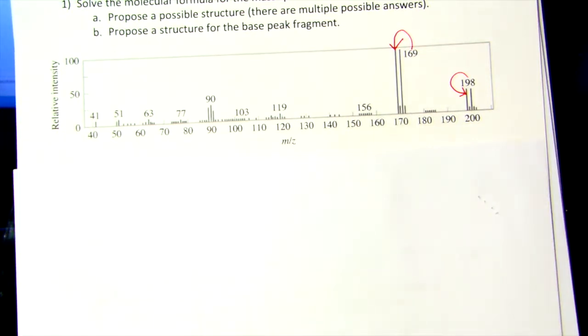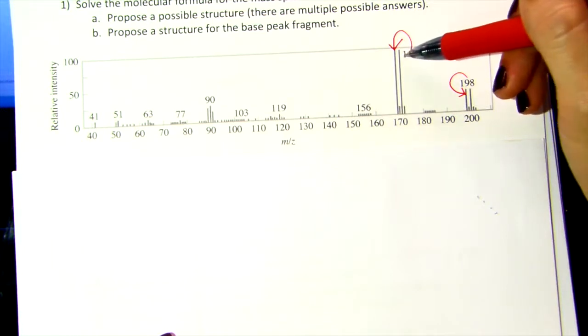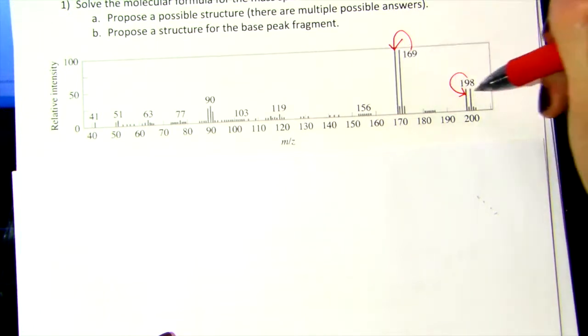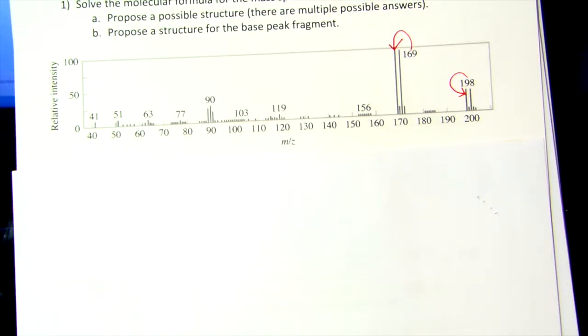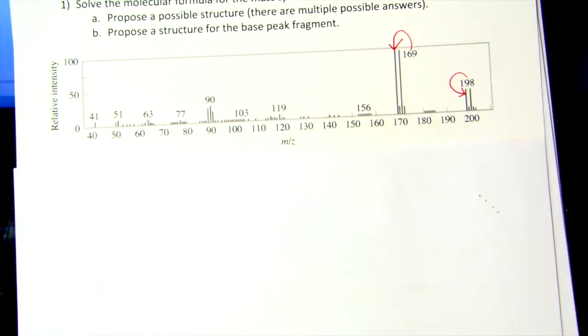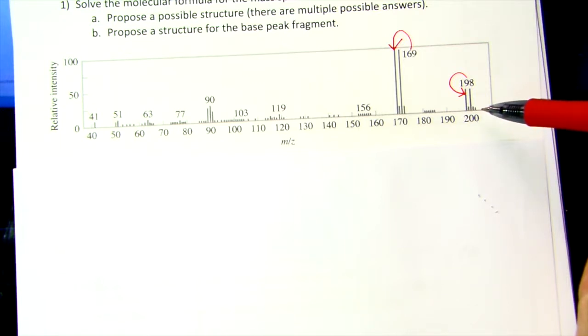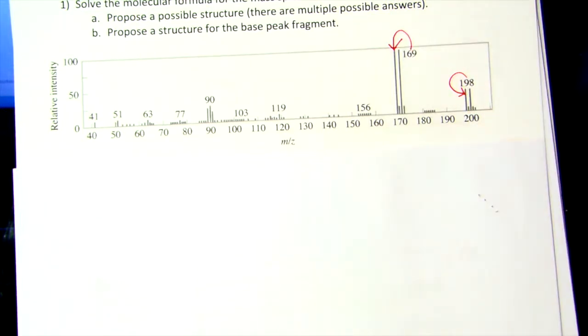And so I already added some arrows because I just want to show you that sometimes you'll see these mass spec and sometimes the numbers will be written next to the peaks. And what's happening here is you'll see there are 2 peaks, so it's like, well, which one is it labeling? It's always labeling the tallest one that's farthest to the left, right? It's just saying that's the mass of that one, and then anything else is just an isotope pattern. So it's labeling the main peak, and everything else with it is just part of the isotope pattern. So it's labeling the one on the left of the cluster of peaks. With the arrow, I'm showing you which peak the number goes with. But even if I didn't tell you, that's what's implied when you see labels like this.